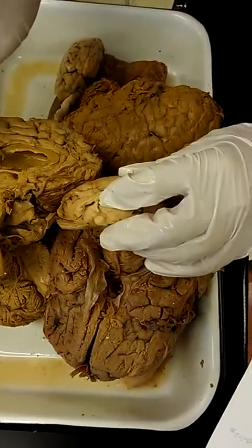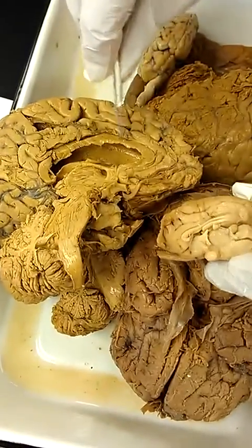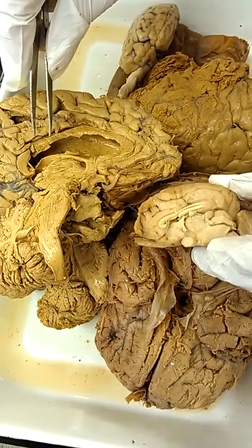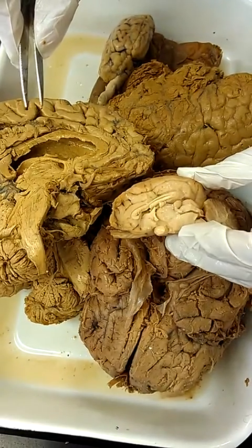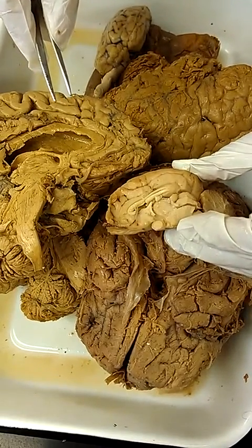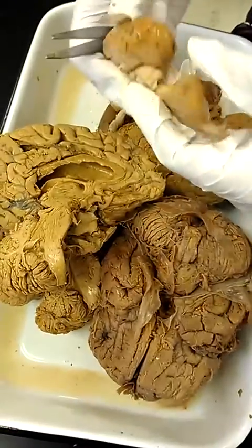Then on the inside of the brain, we have the corpus callosum. That's this layer at the top. Which one? This layer right here, corpus callosum. At the bottom of the first. Not this one. That's the thing that's right here.